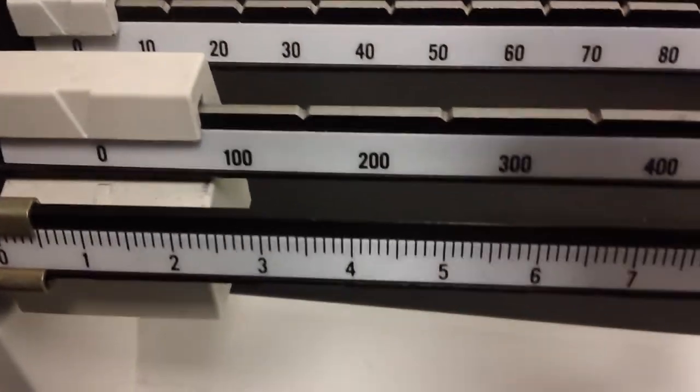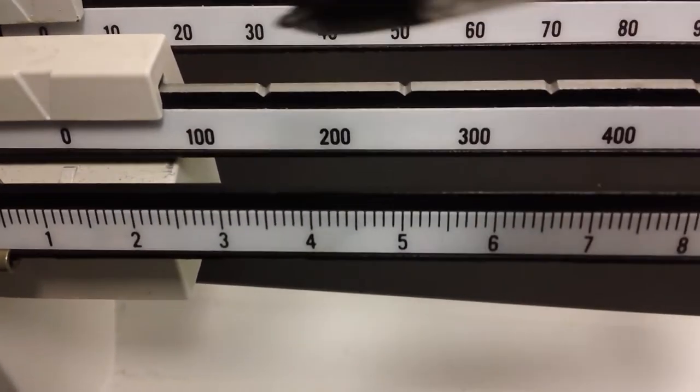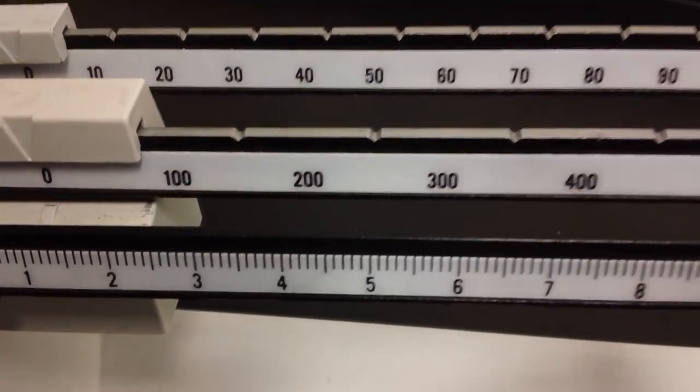And the center arm is actually hundreds of grams, hundred, two hundred, three hundred, four hundred.